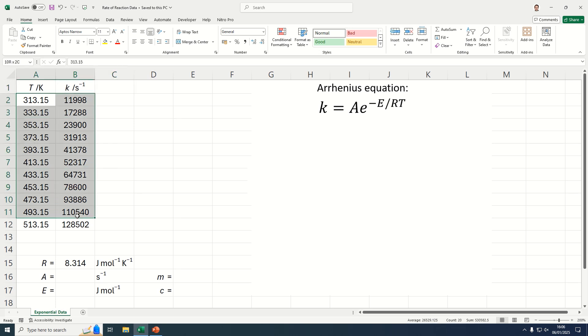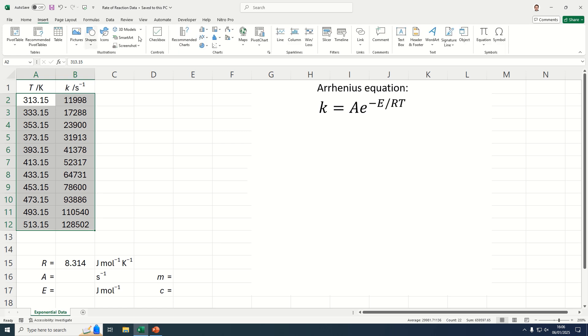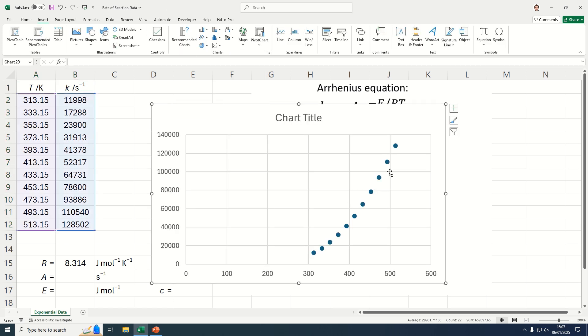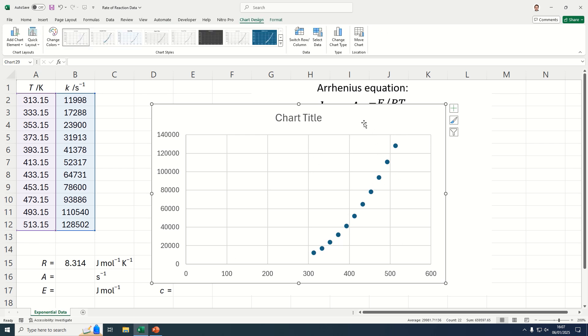If we highlight that data and insert a scatter graph, we can see that we get this interesting shape here, and we actually need to do some processing to this data in order to get it to be linear.